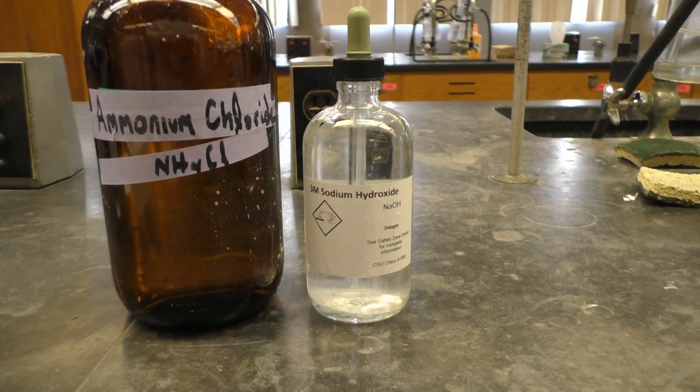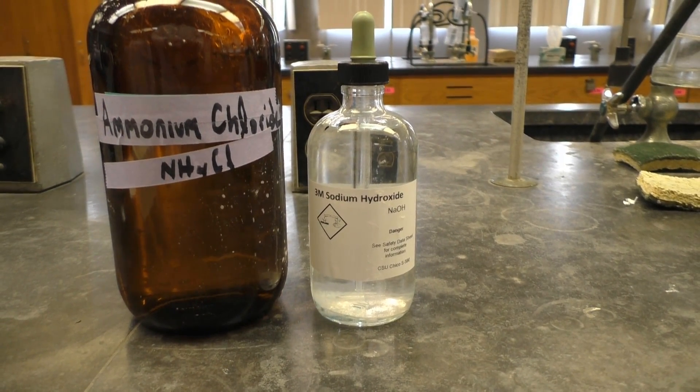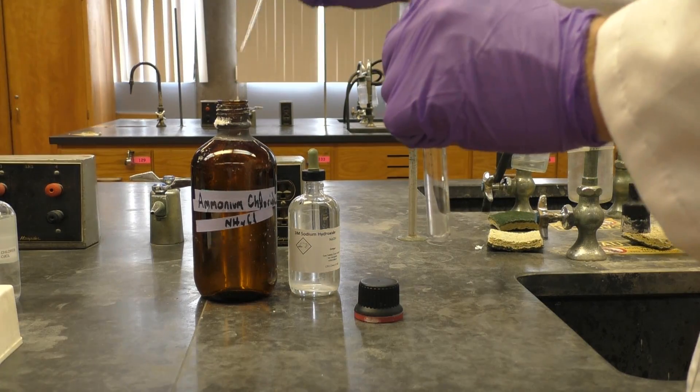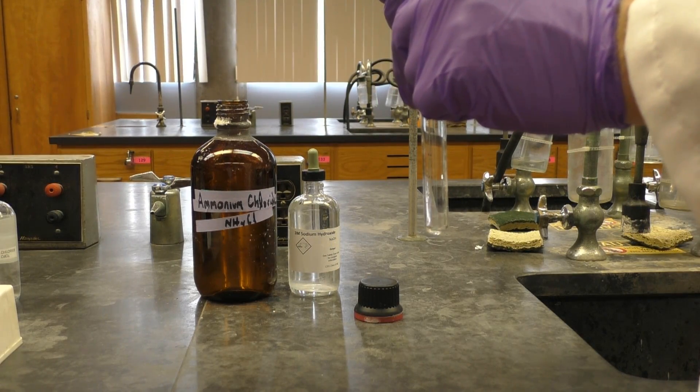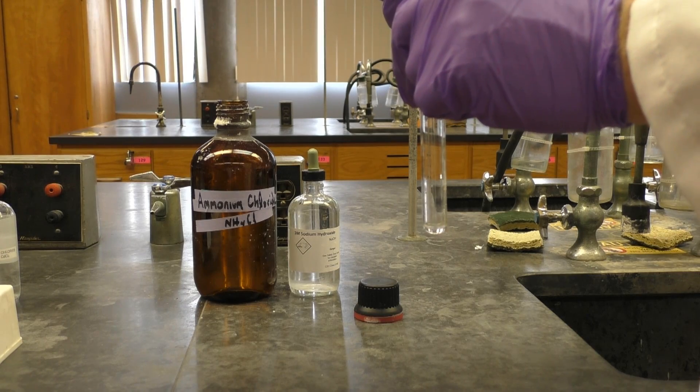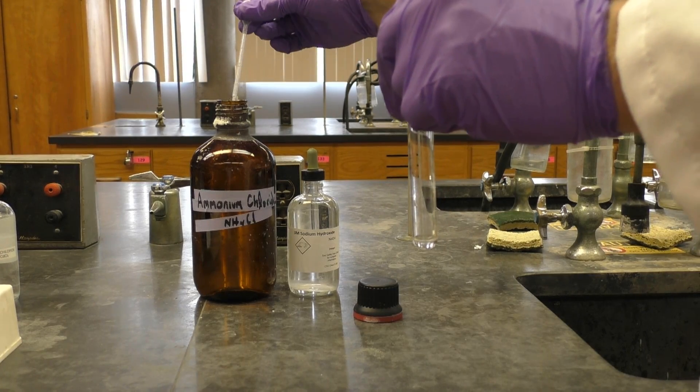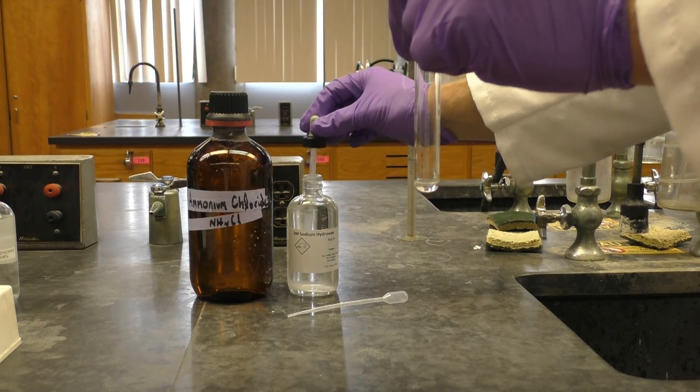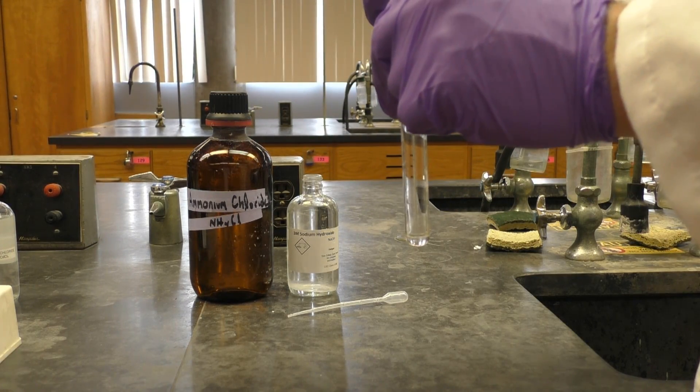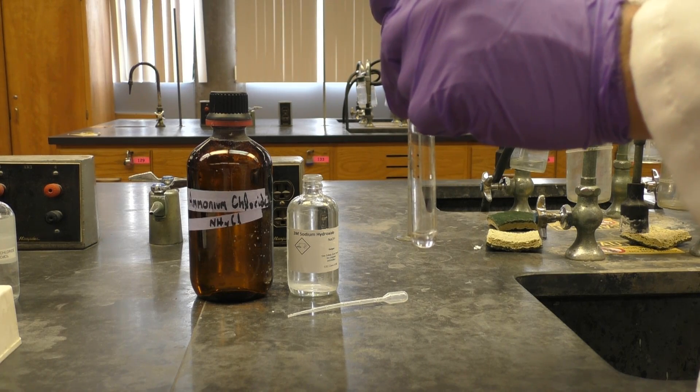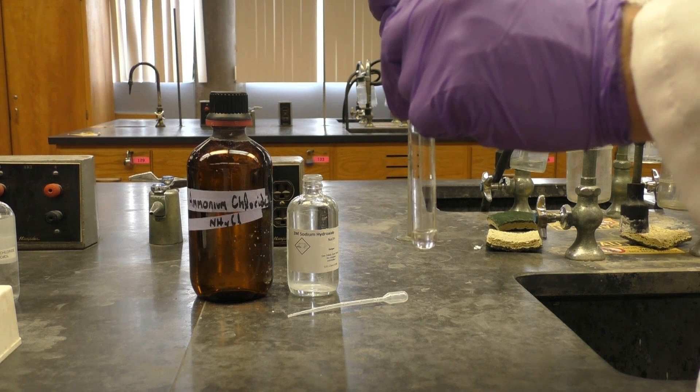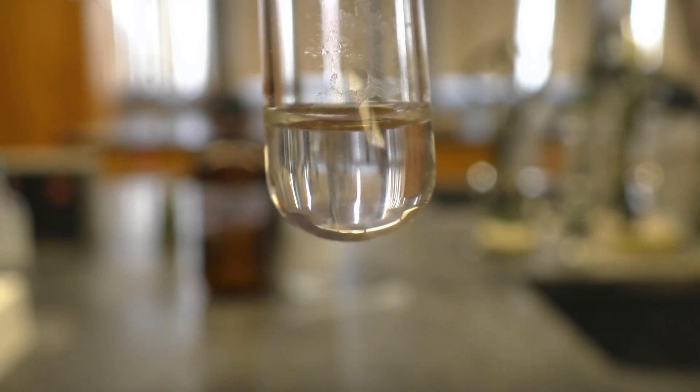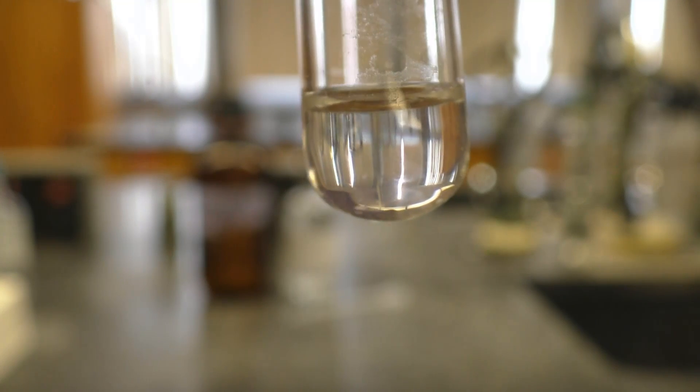Our next demo will be the reaction between ammonium chloride and NaOH. First, add 15 drops of ammonium chloride. Now add 15 drops of sodium hydroxide. Again, it seems that no reaction has occurred, but let's think about what's really going on.